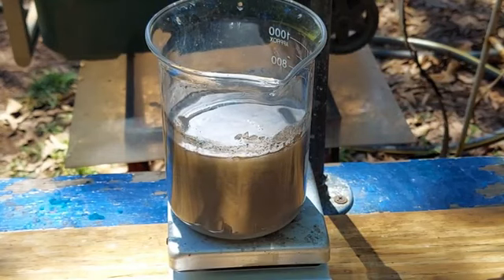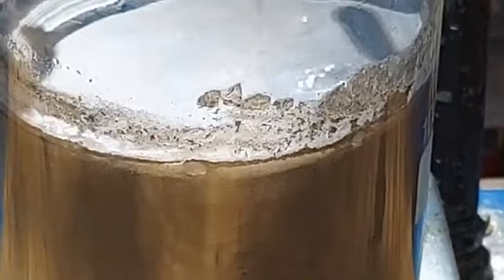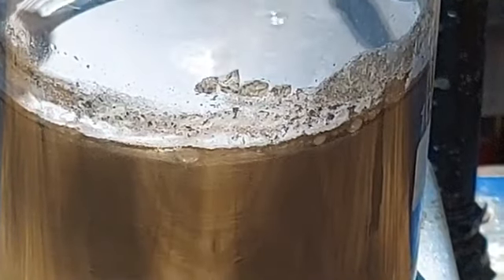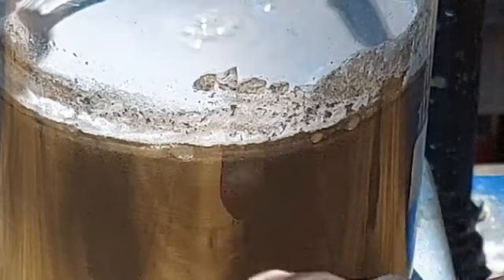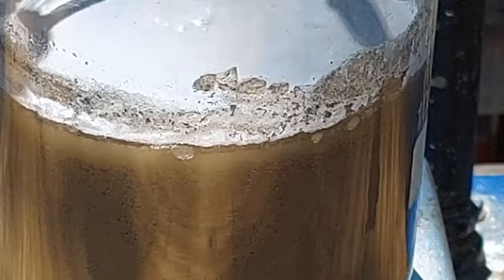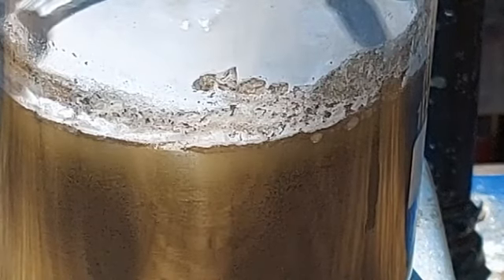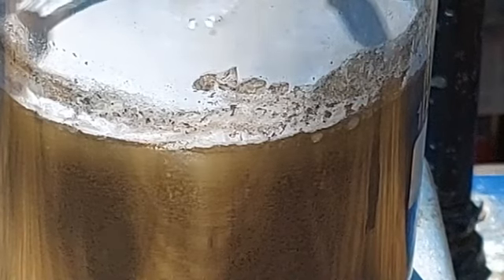Maybe it's just getting full of sediment. Oh, yes. Okay, here's a good sign. Let me get it stirred up here. You stop the stirring and you give it a minute, you'll start to notice that it's settling out. See that? It starts to separate out quickly. Yes! Okay, now we're getting somewhere.